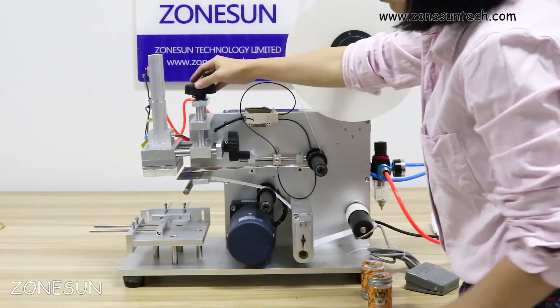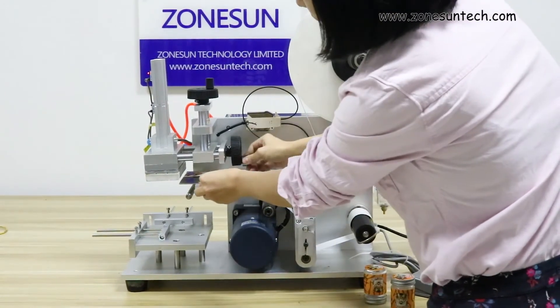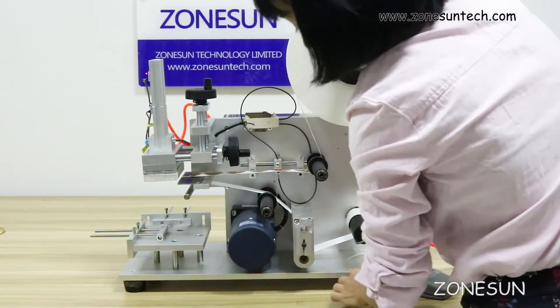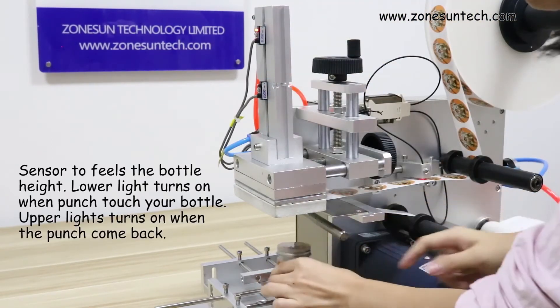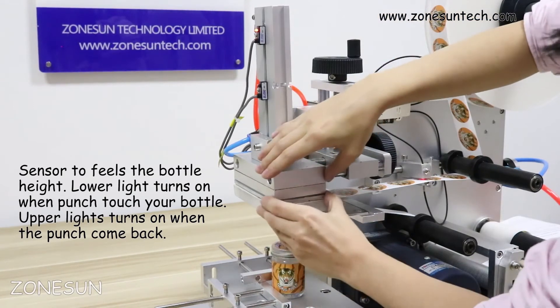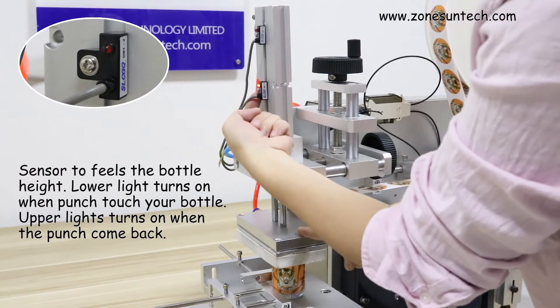These two buttons here are to adjust the height of the working panels according to the bottle or box size — you can move it like that. And these two things here are to adjust and fix the position according to your product. These two buttons here are to feel the position. Put your product on the working panel.